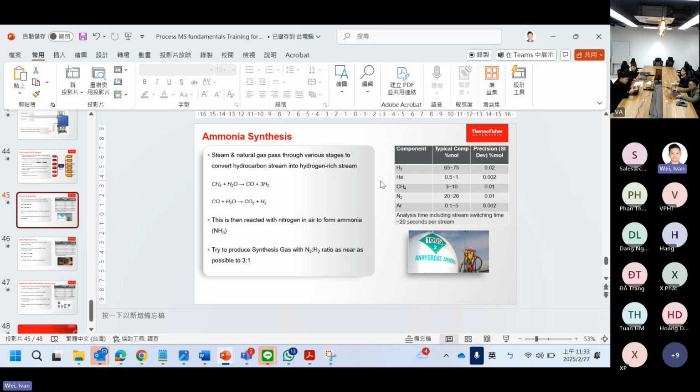So back to your questions. Those can measure all kinds of gas, right? Correct, but this is more application driven solutions. We know it works in certain solutions, certain applications, then we don't really change the recipes.